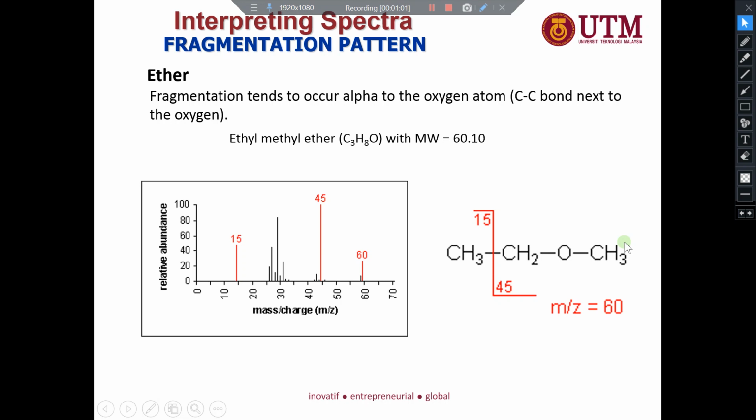Alright, but for the ether, what is important is that the alpha or primary cleavage happens at the C bond after the COC lah. Okay, antara selepas yang ni COC ni dia akan potong dekat lepas tu. Okay, kat situ. Ni contohnya. Tapi tak semestinya ini adalah abundance, it depends on the situation. But usually kita akan bagi the mass spectrum and then you need to somehow give the structural formula. You need to draw or suggest by drawing the suitable molecular structure. Okay.